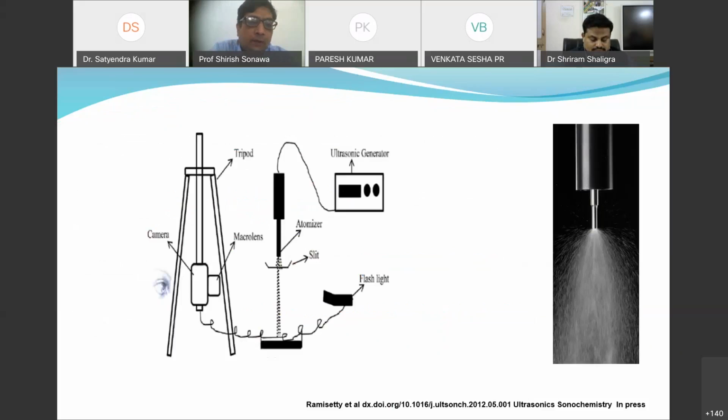So you can see, this is an ultrasound atomization process. On the right-hand side, you can see how the droplets are going to be formed. This is an ultrasound generator. It is the same way as an ultrasound probe, in which through the orifice the droplets are formed and spread out. Based on the Rayleigh mechanism, the swiping of the liquid happens once it comes onto the tip of the atomizer, and because of that, smaller droplets are going to be formed.